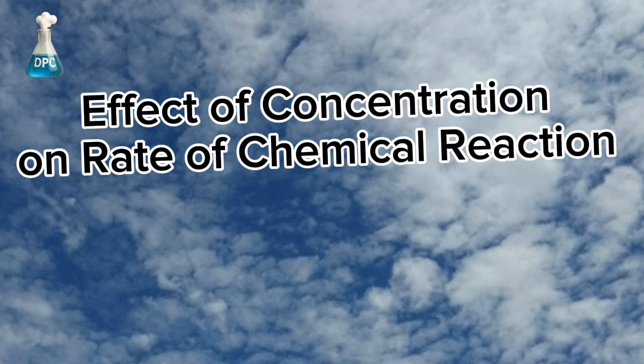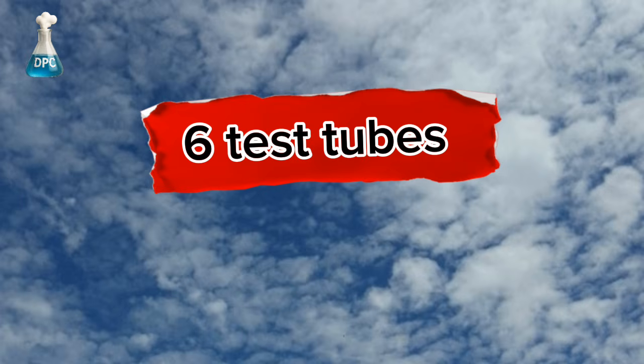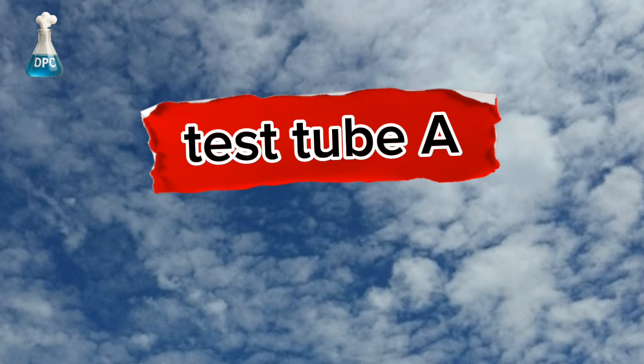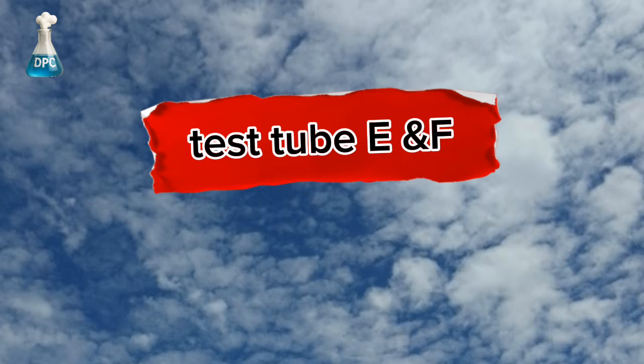Effects of concentration and rate of chemical reaction. Now in this experiment we will need 6 test tubes. We'll label these test tubes test tube A, test tube B, C, D, E and F.